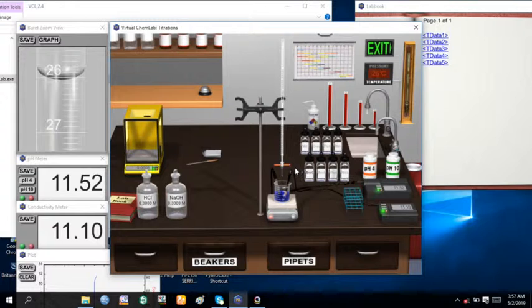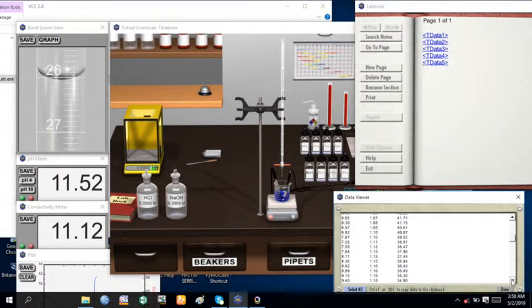So this is one of the results too. You can also record it. But in actual fact, if you measure this correctly, you get the result from the database as in one of the experiments we recorded, 24.90. Let's check the experiment. Watch me. The result from the data viewer.